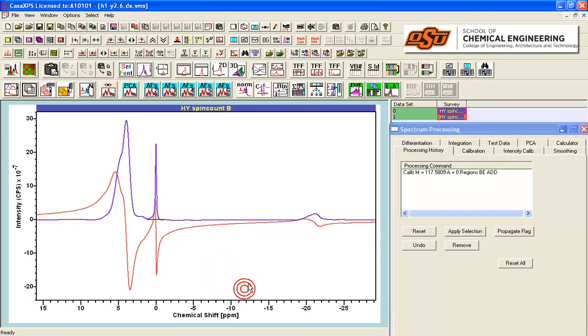And it's not confined to transferring the calibration to spectra within the same file. You can calibrate to any file that you can select. So you load files and you select the VAMAS blocks, you bring up your reference peak, and then you can propagate in exactly the same way to spectra that are in different files to have exactly the same calibration.